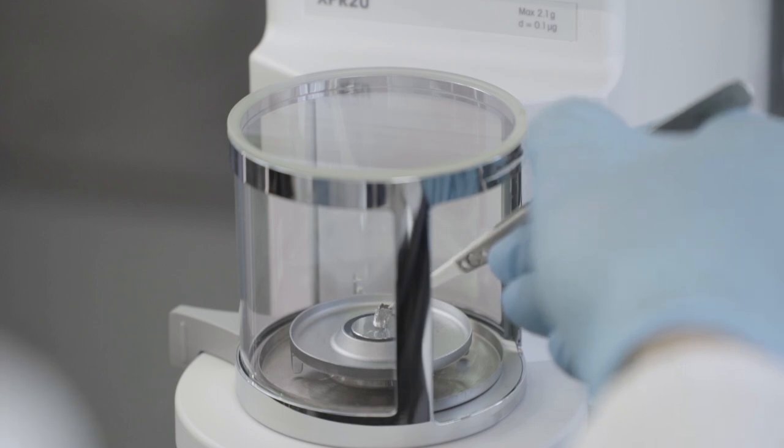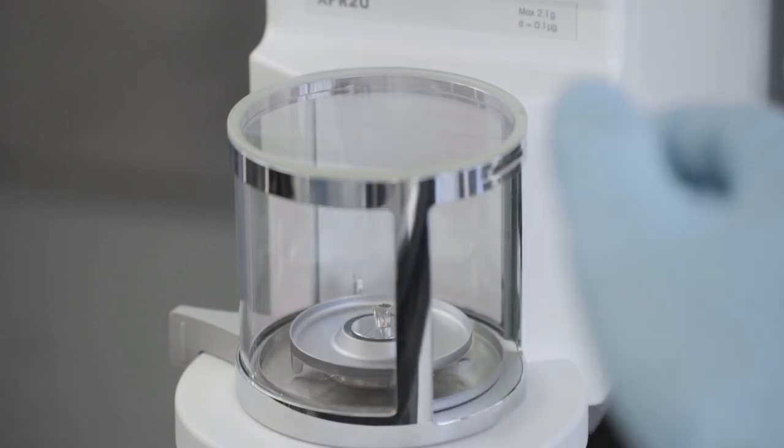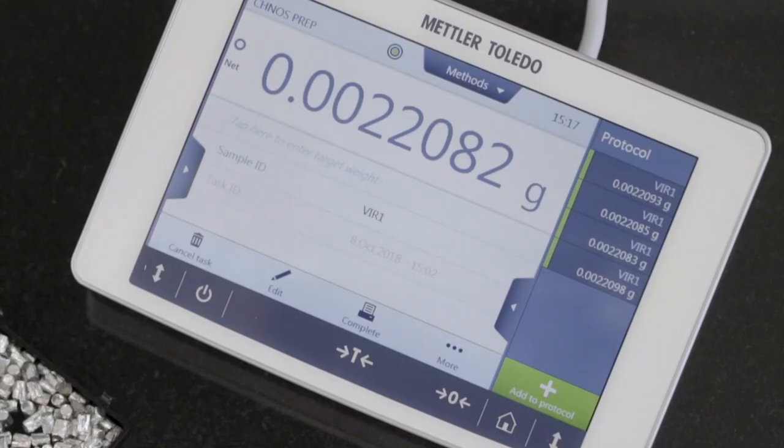Advanced temperature control helps save time by delivering weight results considerably faster than a standard microbalance.